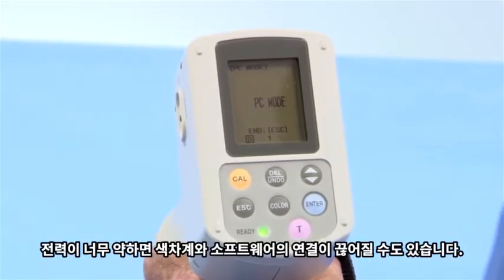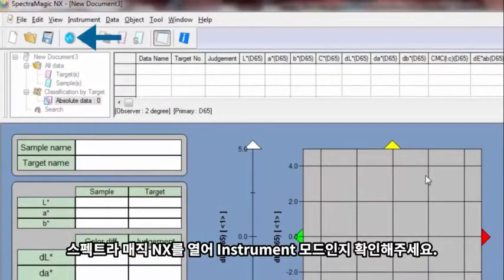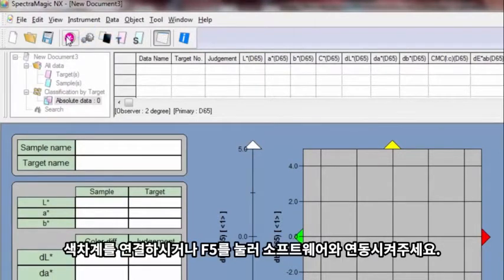If batteries are weak, communication between the instrument and software may be lost. When you open SpectraMagic NX, make sure the program is in instrument mode. Connect the instrument or press F5 to communicate with the software.